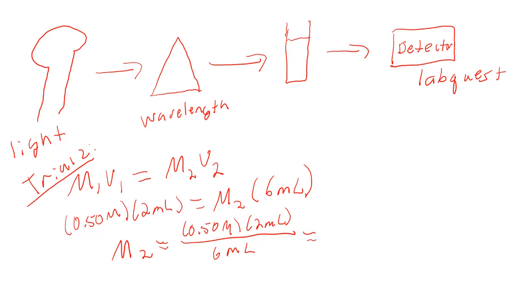If you press calibrate every single time, what you're doing is you're telling it that that solution is the baseline. So you're going to keep getting an absorbance of 0. So you only press calibrate when you are doing the blank.